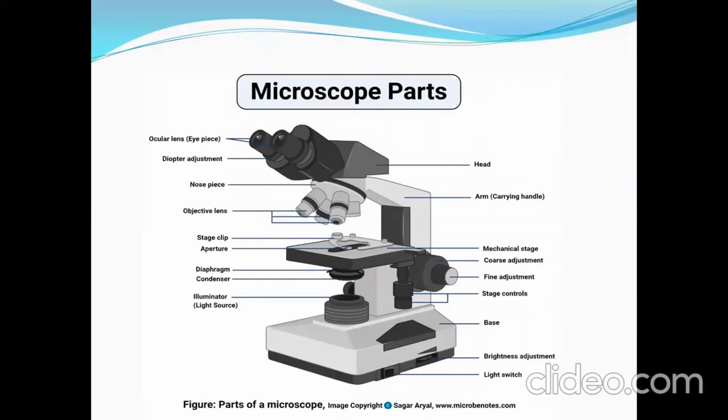Clear? In this way, we can have a maximum of 2000 times magnification with this type of light microscope. How 2000 times? Because in some cases, instead of 100x in the objective lens, 200x may be present. And if we use 10x in the ocular lens, we get a 2000 times magnified image with this type of compound microscope. And that is the limit of the compound microscope.